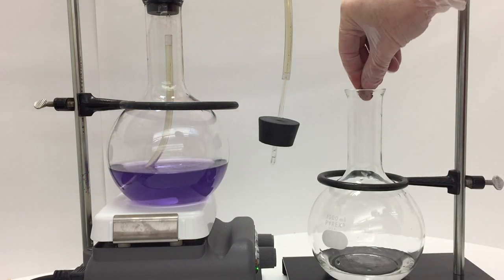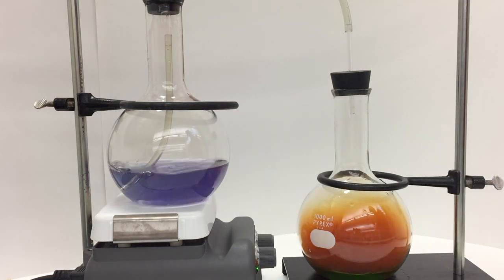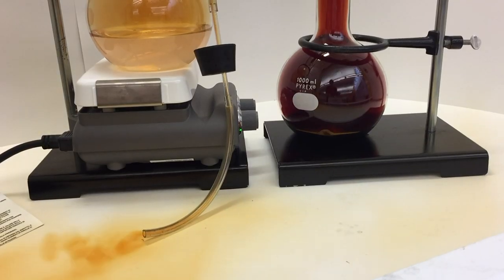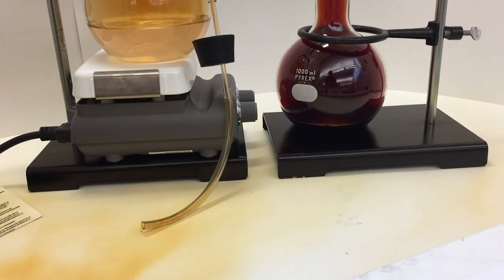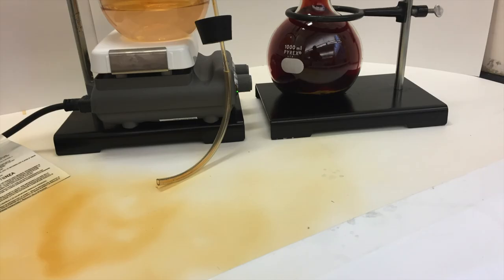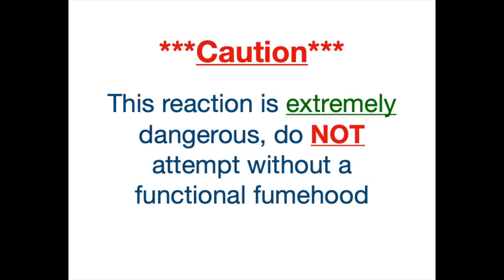Let's watch that reaction again at four times the regular speed. Reminder, this is a very dangerous reaction. Without a fume hood, this is what you can expect: that brown gas spewing out into your lab and forming nitric acid in your lungs. Please do not attempt this experiment without a good functional fume hood.